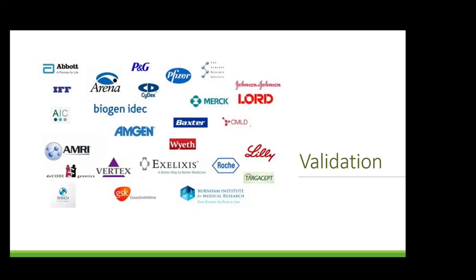Validation is a critical technique that keeps everyone safe. Validation helps companies to ensure that the products they produce for patients are safe, effective, and produced to the proper industry and safety standards. Validation is a must-have procedure in pharmaceuticals, but is also extremely critical in the food industry. Other industries also use validation to ensure that their equipment works properly before introducing it into the production line.